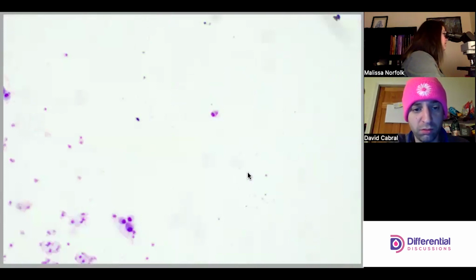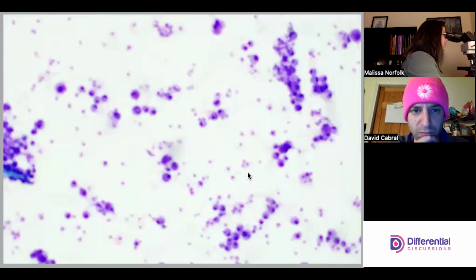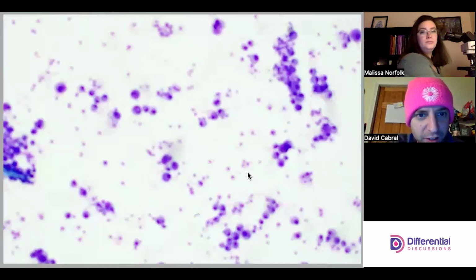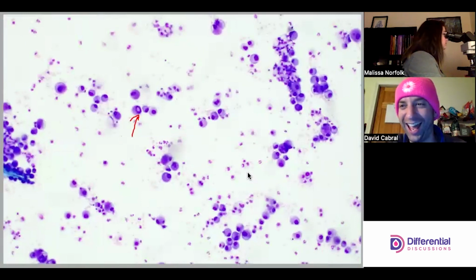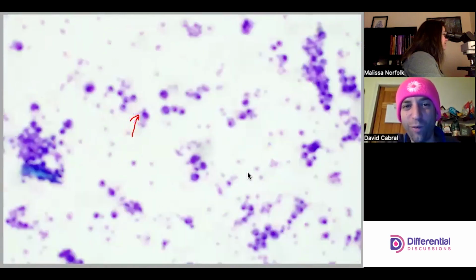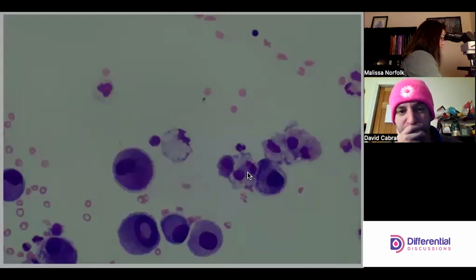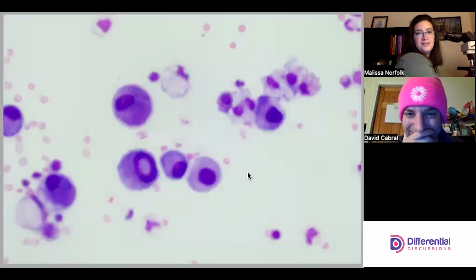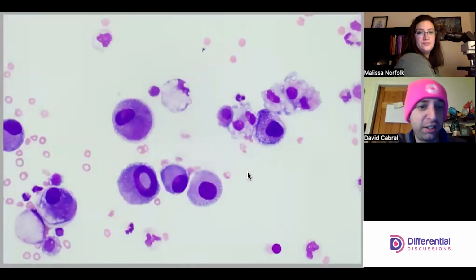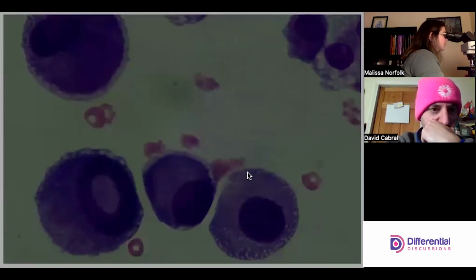All right, let's go back towards the other side where we first started. It was this area that you saw something. It's a little out of focus, but what's going on with that cell? Oh, I see. I will drop there. Do you want me to drop again? It's up to you. If you want to get comfortable on oil, then we can just go on oil. Forty looks decent too, but this way we're not switching back and forth.